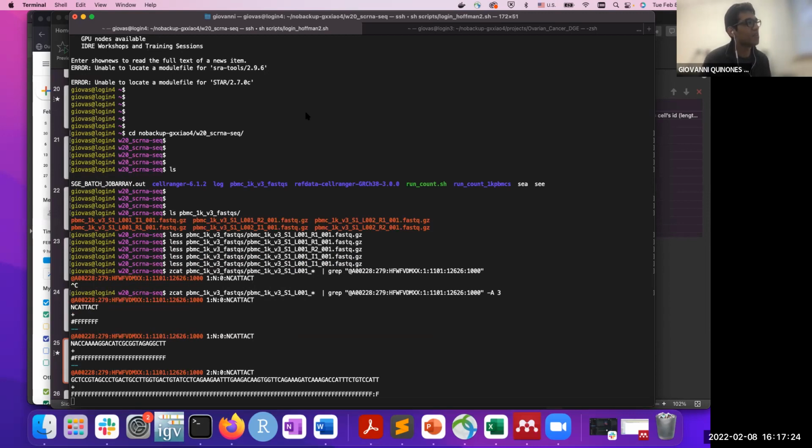This is probably a little confusing right now. If you have experience with RNA sequencing data, you know that your reads could match the sense of the RNA you're trying to sequence, or could align to the reverse complement. That's why it could be confusing, but in this case, R just means read.